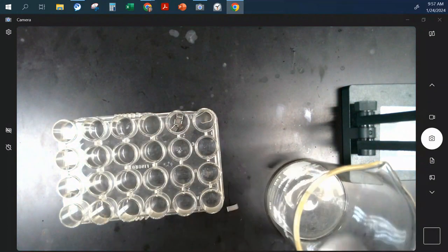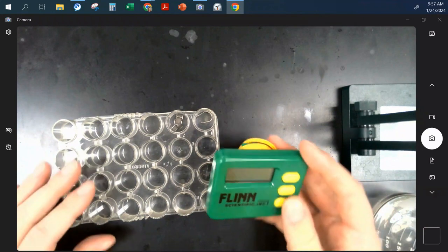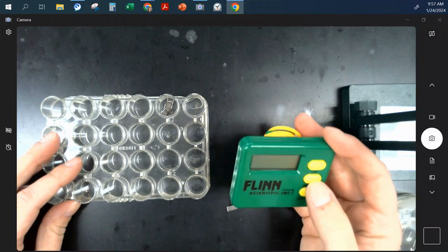Okay. All right. So if we're testing particle size, though, I have the same amount, and I've broken it up, and then I would take my hydrochloric acid and put some in. This is something where we are measuring rate. So what do you think would be helpful to know? Time, how long it takes. Okay, so that's something that I should tell myself to do in my procedure. Turn on the stopwatch. There are stopwatches in the lab.